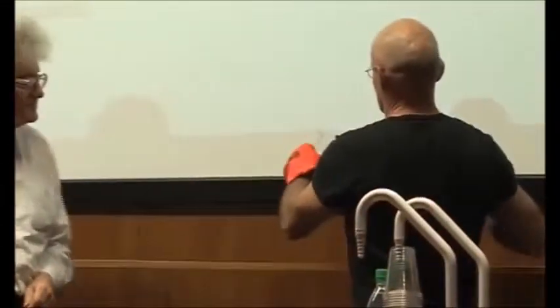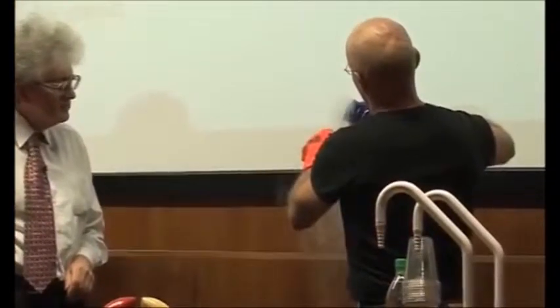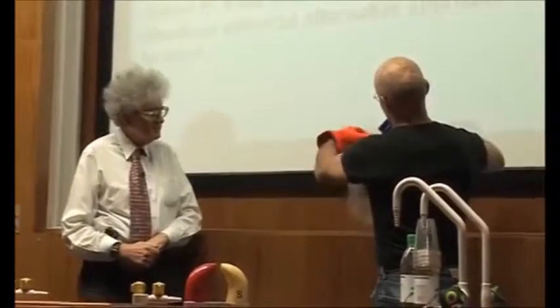So we begin with Neil's very high-tech piece of equipment, which is a test tube on a piece of string. What we're going to do is to put some liquid nitrogen in here. You can see liquid nitrogen, well, you may not see, is colourless.